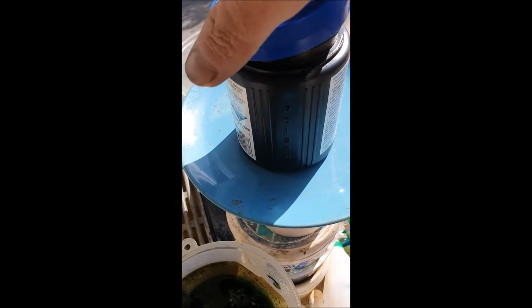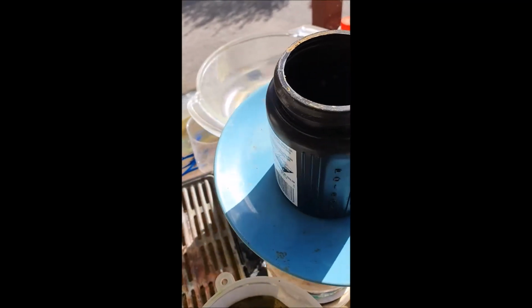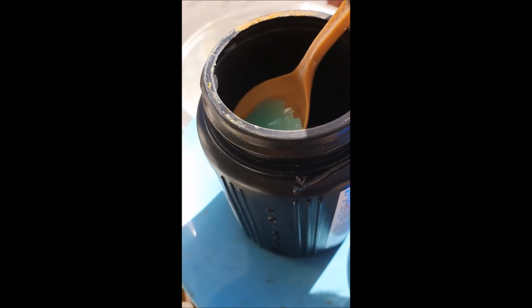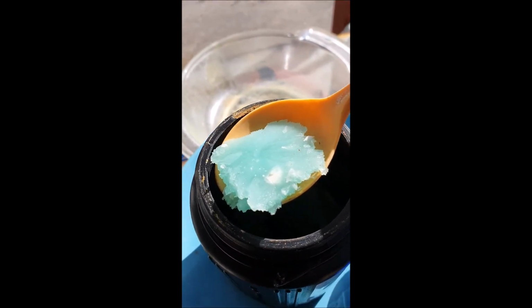Alright, I got the crystals condensed down. These are the ones that were filtered. The ones that weren't filtered, the ones that I put away before, at some stage will need to be reconstituted and filtered. But look how nice these look. Beautiful.